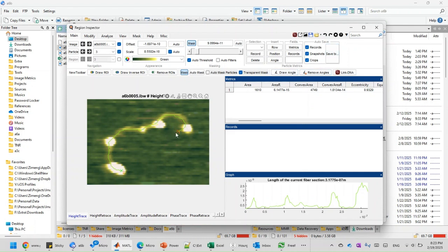the file again. In this case, you just pick the same file, right? You're not going to overwrite that file. Essentially, it's only going to add new information to the bottom of that Excel file. I'm going to do this very quickly. I'm not going to do a real analysis, just a fake analysis.